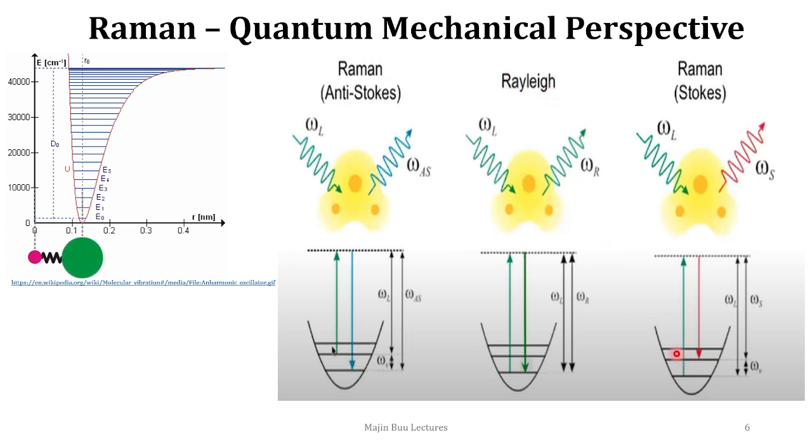On the other hand, if the energy of the incident electromagnetic wave is greater than the resultant scattered rays, which probably on interaction with the system has gained some energy, and thus might have resulted in the emitted scattered light having frequency lower than the incident one, then you call it the Raman Stokes.